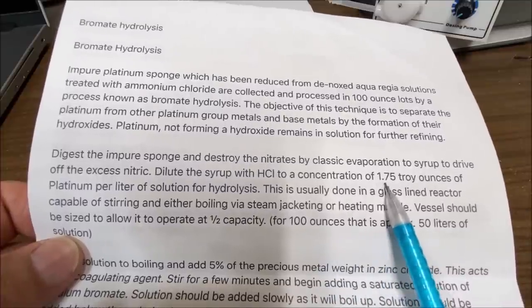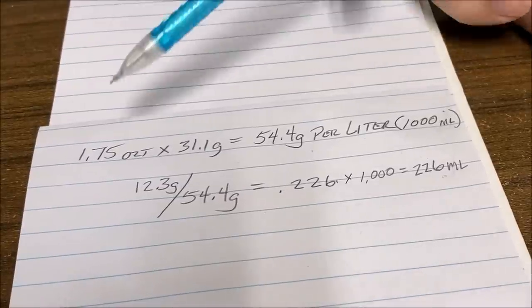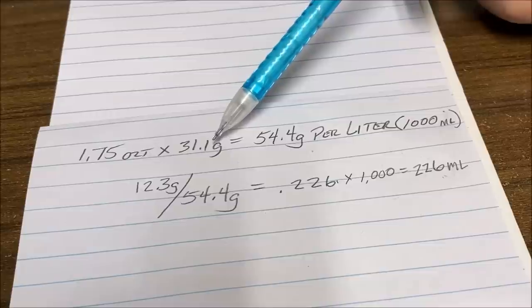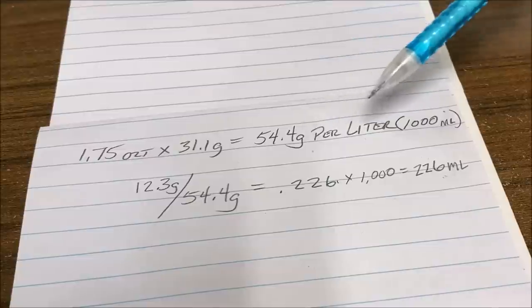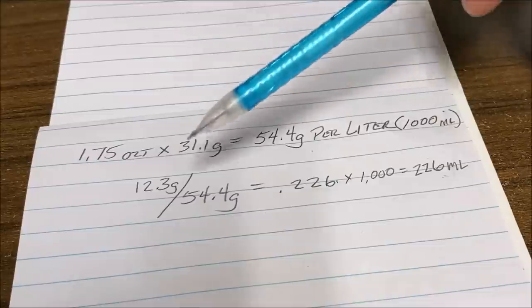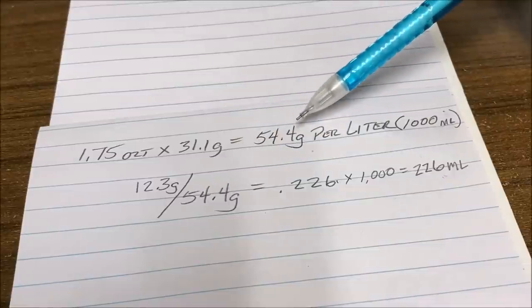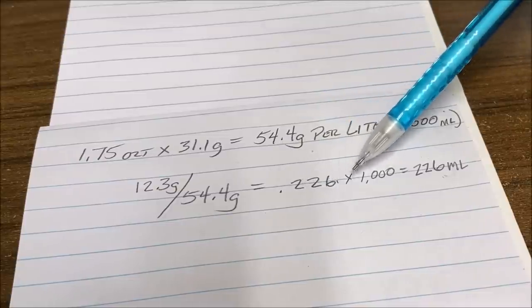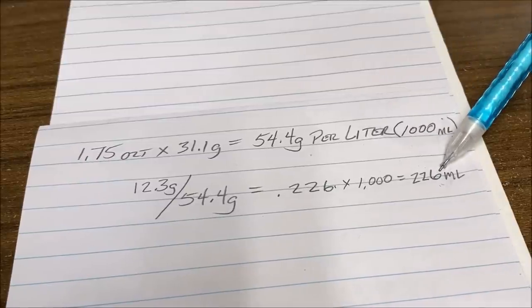Concentration must be 1.75 troy ounces per liter. What I've done here is a few calculations. 1.75 troy ounces, multiply that by 31.1 grams, because that's how many grams is in a troy ounce. We get 54.4 grams per 1,000 ml. We're working with 12.3 grams, so we divide that by 54.4, the required amount that we need, and we get 0.226. Multiply that by 1,000 milliliters, and we get 226 milliliters.